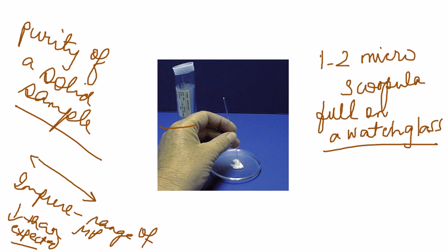Since we are going to do 4 samples, between you and your lab partner, you should divide the work, and each of you should do at least 2 samples, so you get a good feel for the melting point. To prep the sample, you take a little bit of it and put it on the watch glass, and you use the back of the spatula.